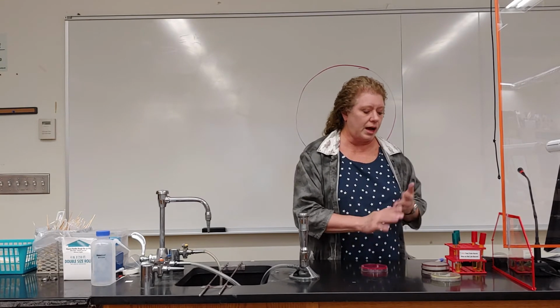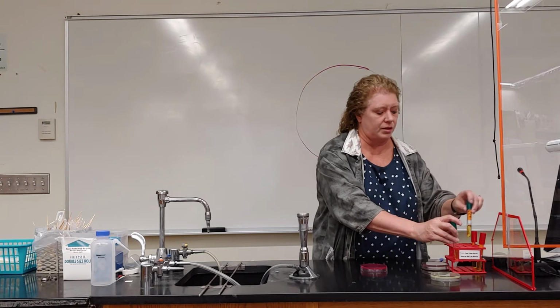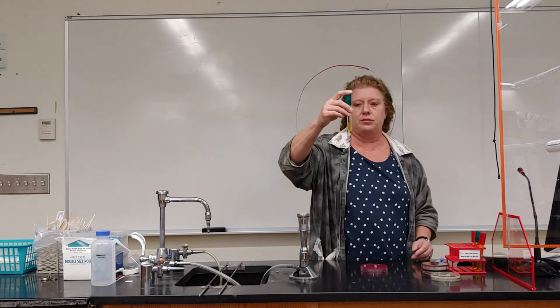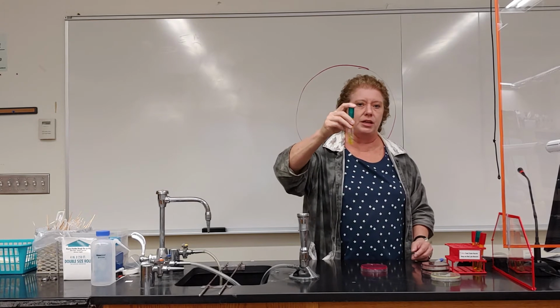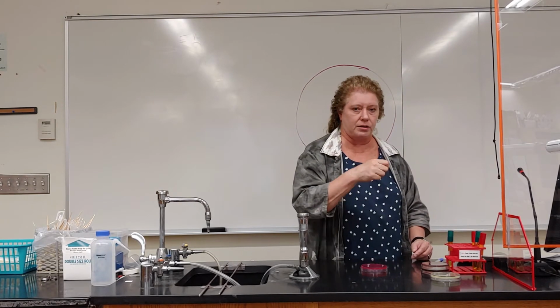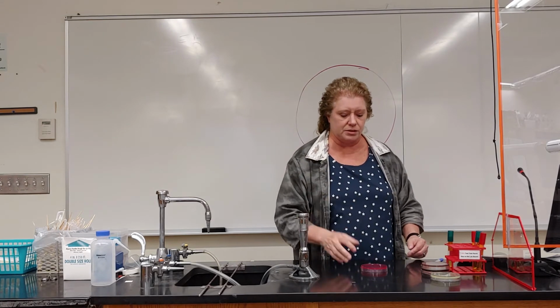I'm going to go through just one inoculation of one bacteria because it's just repetitious of the other 3. So I will pick the E. coli. I'll put those 3 aside. So I've got the E. coli culture. Remember, it's a broth culture. You want to agitate it back and forth, not shake it up and down, so you suspend the cells.